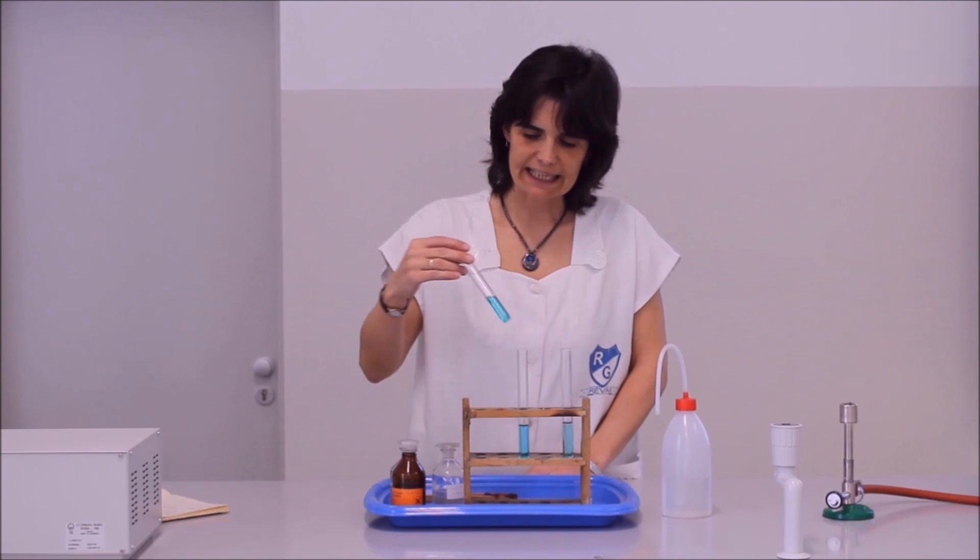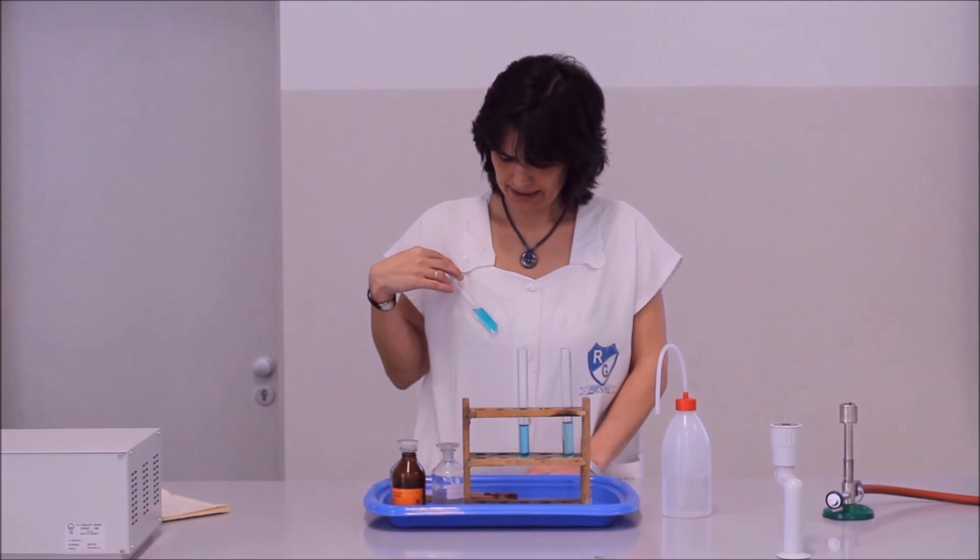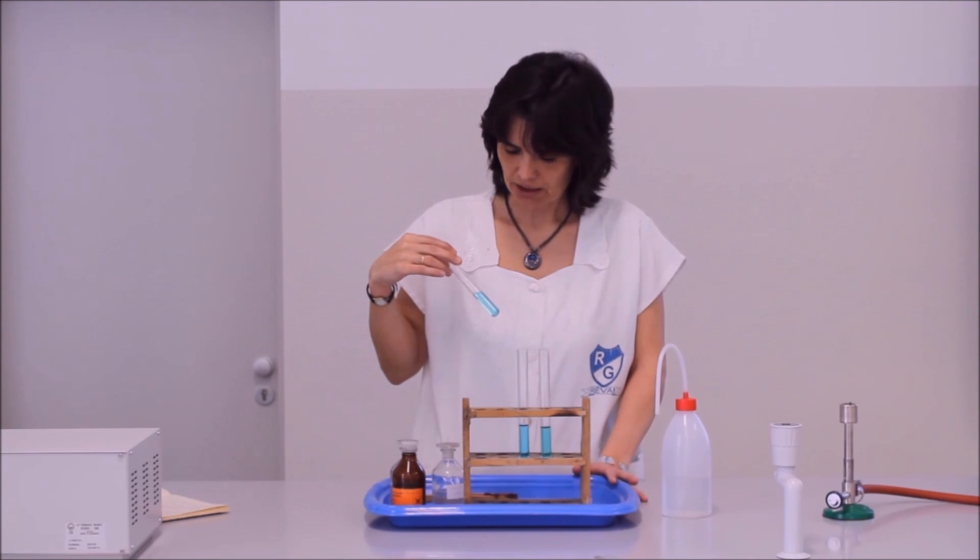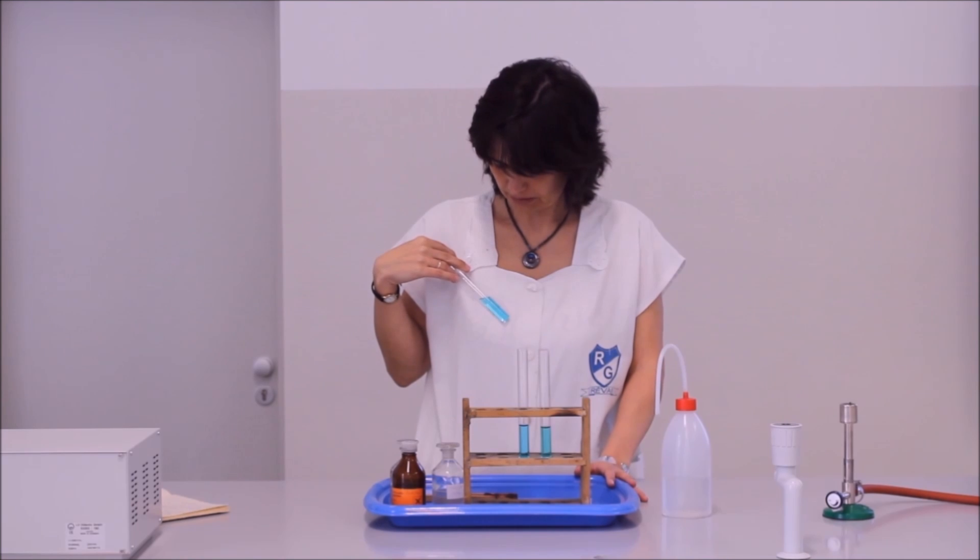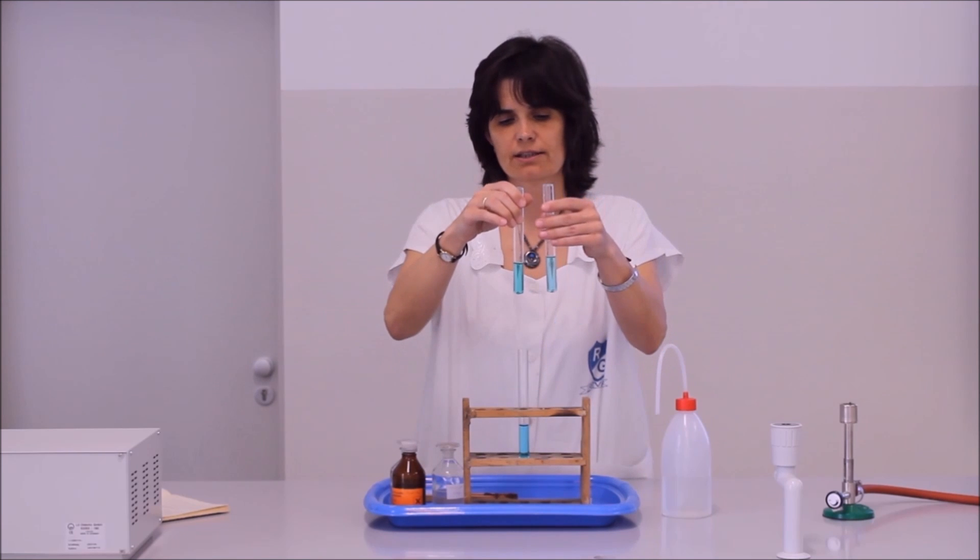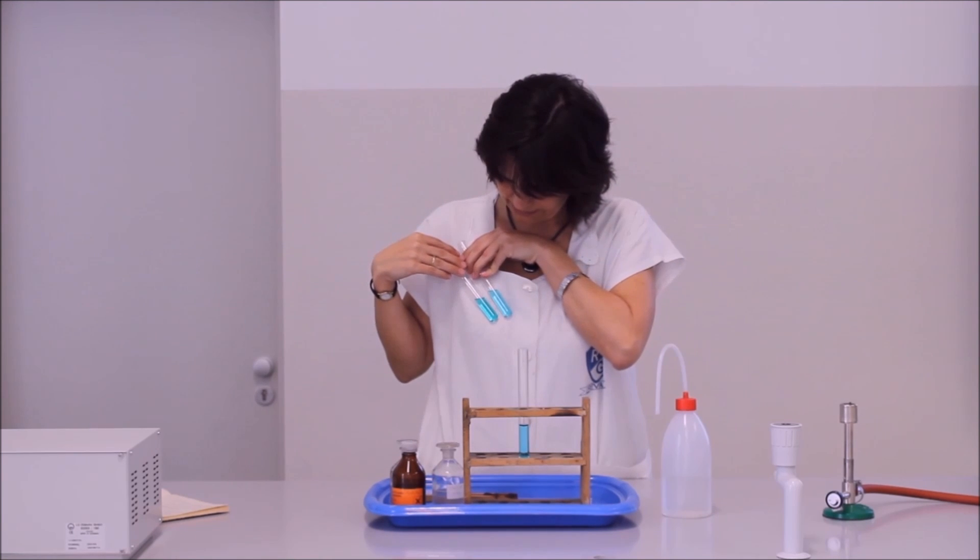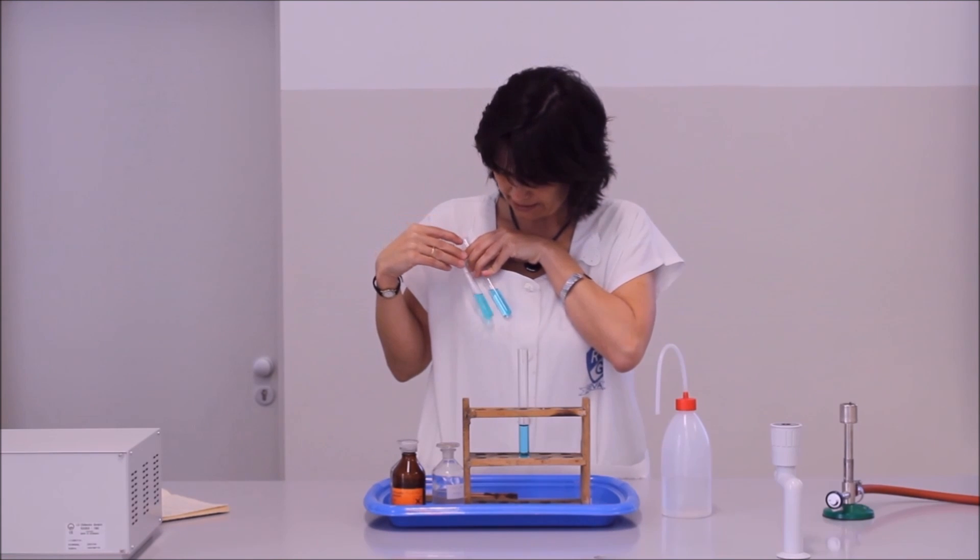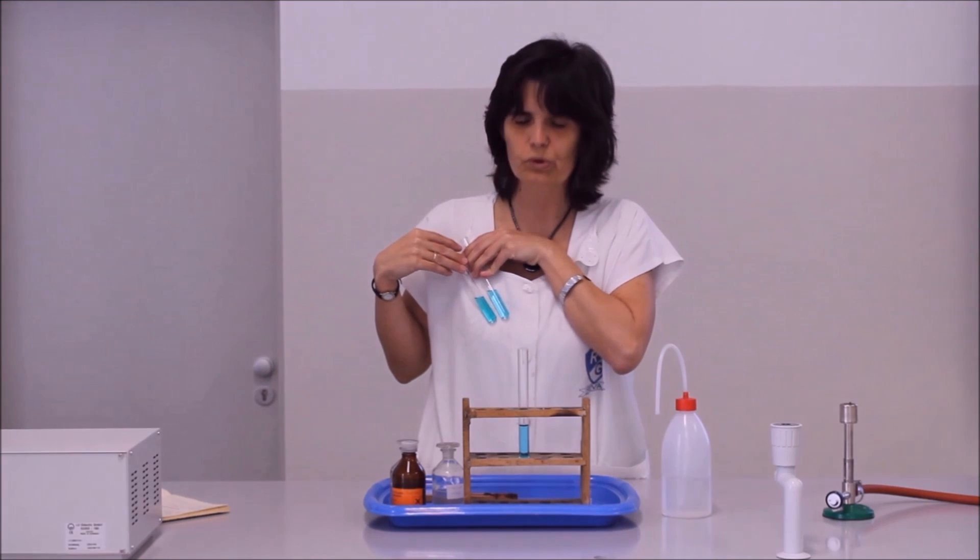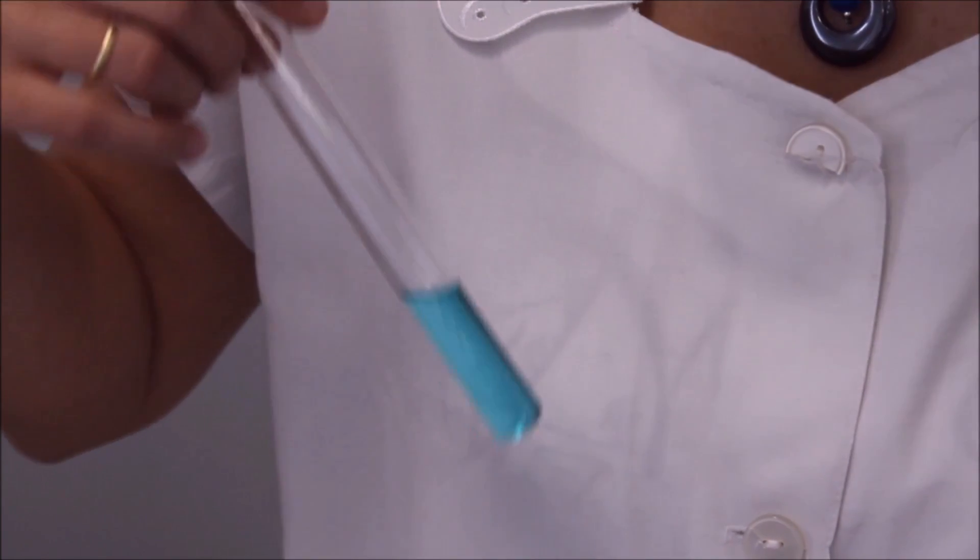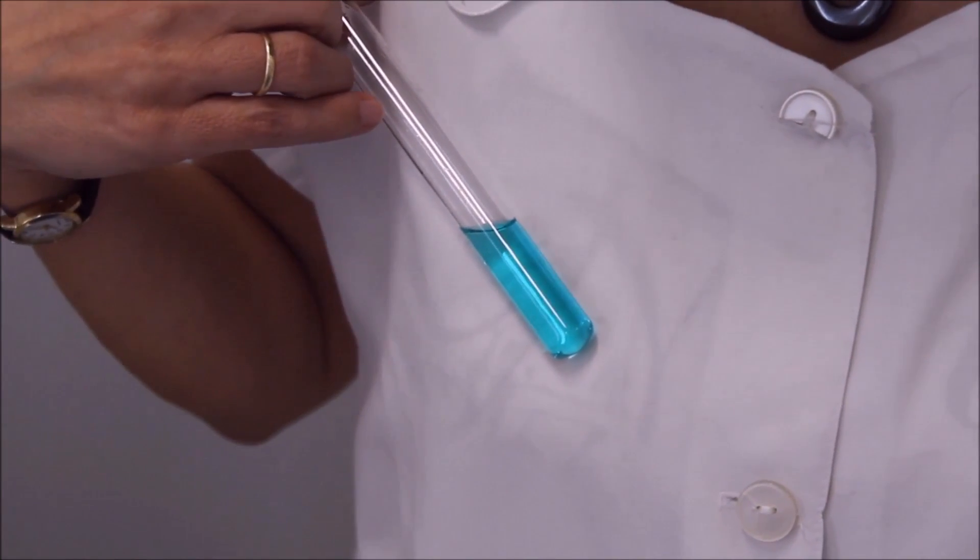Ez a desztillált vízzel hígított egyensúlyrendszer kékeszöld színű, ez pedig a telített káliumszulfáttal hígított egyensúlyrendszer. Számra annyira nem lehet különbséget tenni a két oldat színe között, viszont így jól látható, hogy az eredeti vízzel hígított zöldesebb, a káliumszulfáttal hígított pedig kékesebb színű.